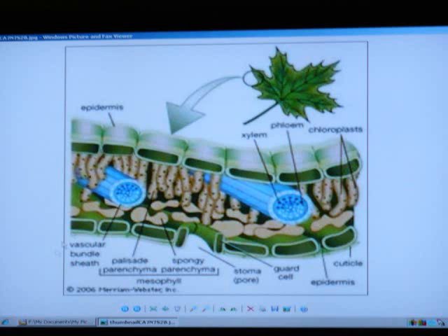These cells right here, the tall, long columns, that's your palisade. I've seen books say palisade cell. They've said palisade mesophyll, and now they're saying palisade parenchyma. It's the same thing. And down here, kind of like peanuts, they're the spongy ones. Now, again, see your dots? Those are the chloroplasts in this cell.